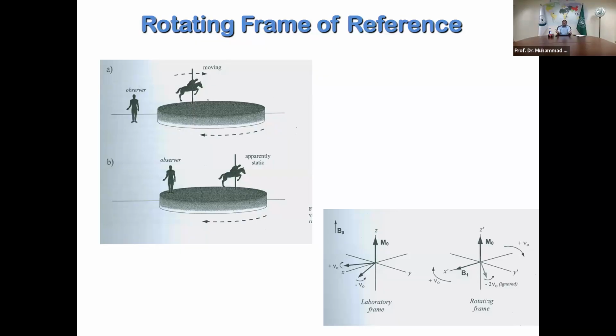So what actually happens is a simple mathematical equation that you subtract. When you're recording the FID, you subtract the operating frequency of the NMR spectrometer, and that becomes absolutely easy because mathematics is now conducted on a few hertz of difference rather than on megahertz of difference. So it makes life easy.